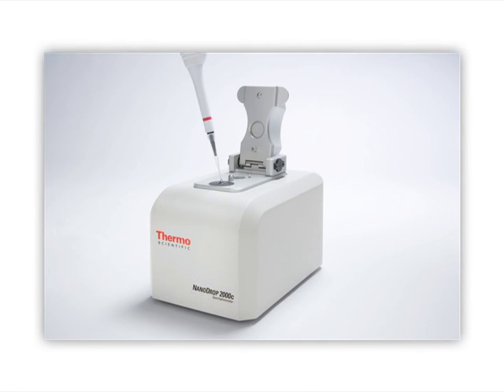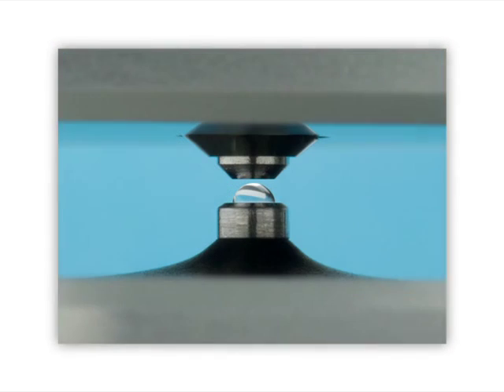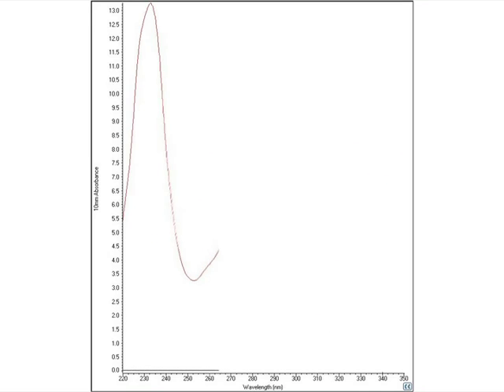NanoDrop technology combines fiber optics and surface tension to hold and measure small amounts of samples, such as nucleic acids and proteins. A small droplet of sample is pipetted directly onto the lower pedestal. An upper optical pedestal then engages the sample to form a column. The pedestal automatically moves to adjust for optimal path length. Shortening the path length eliminates the need to perform dilutions for most protein samples. Measurement occurs in seconds and UV-VIS spectrum results are displayed.